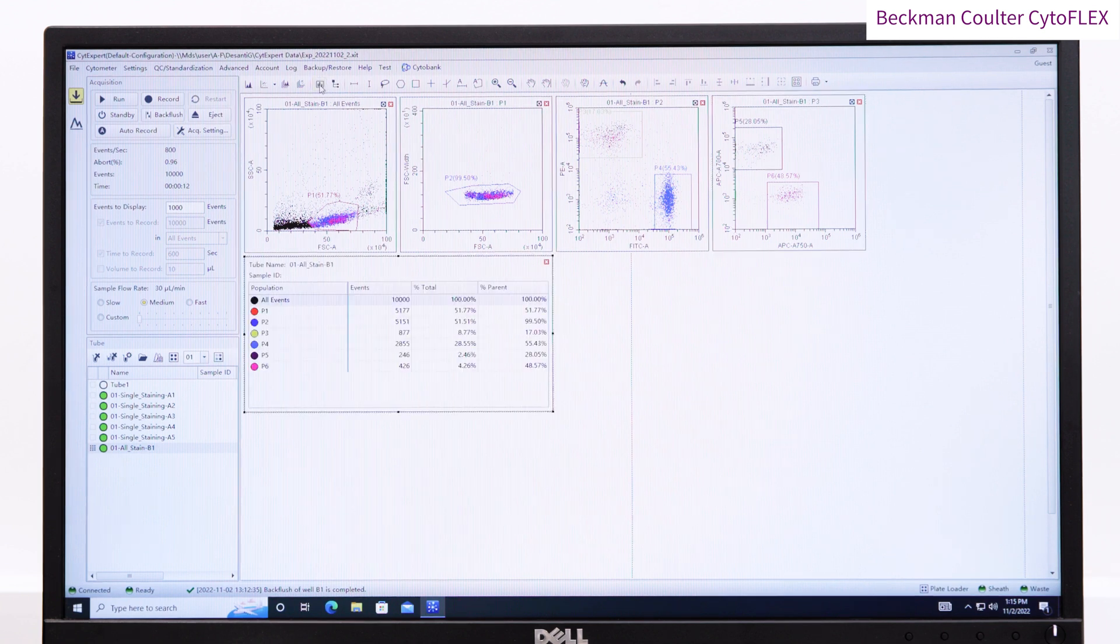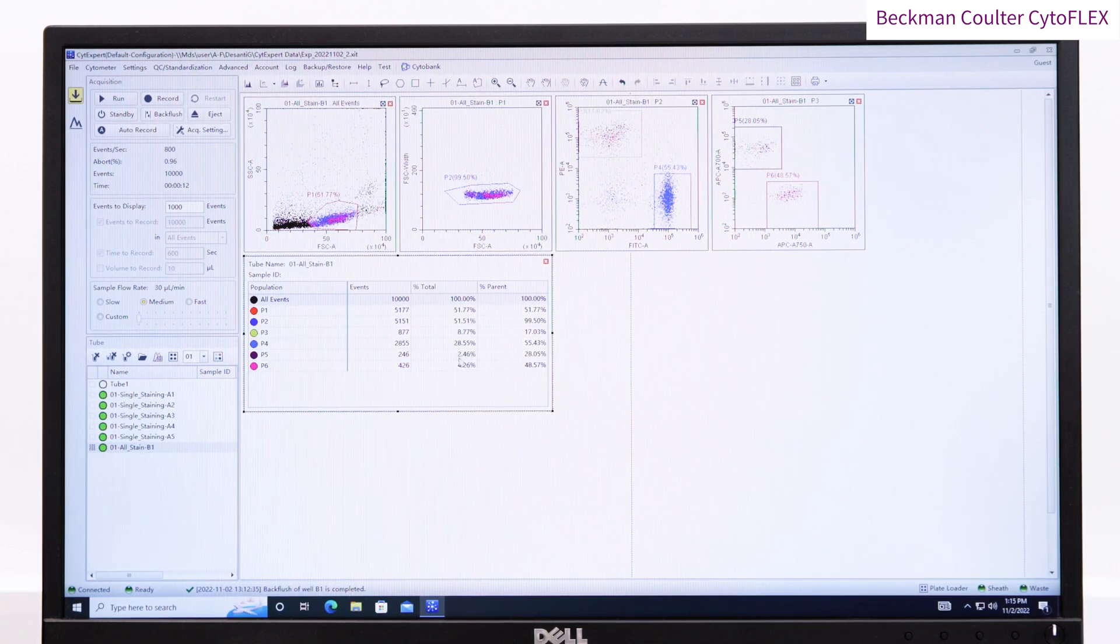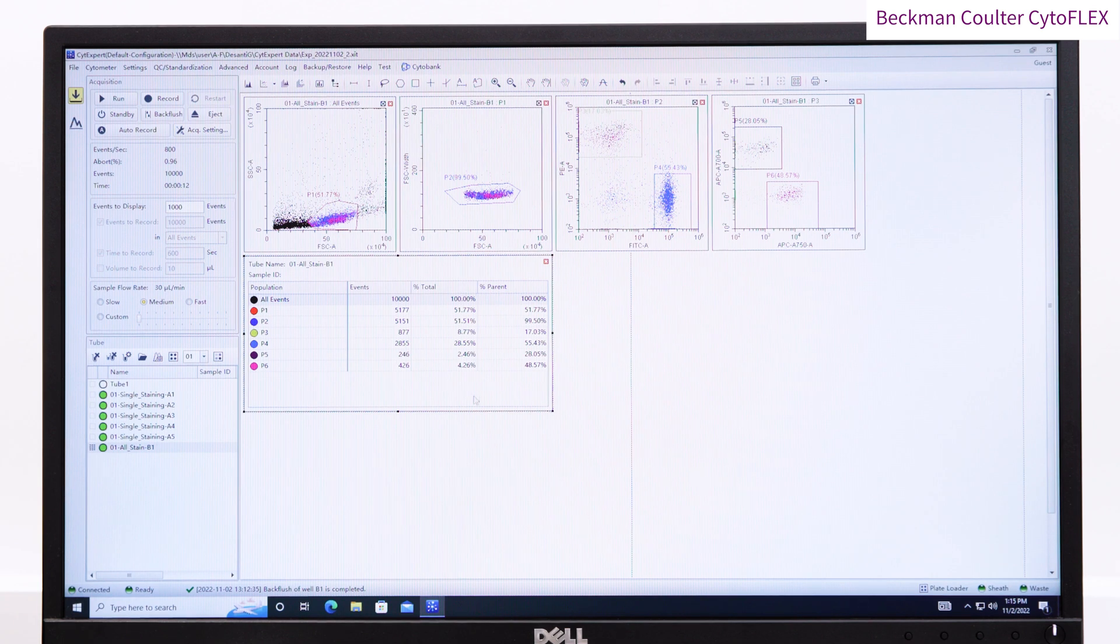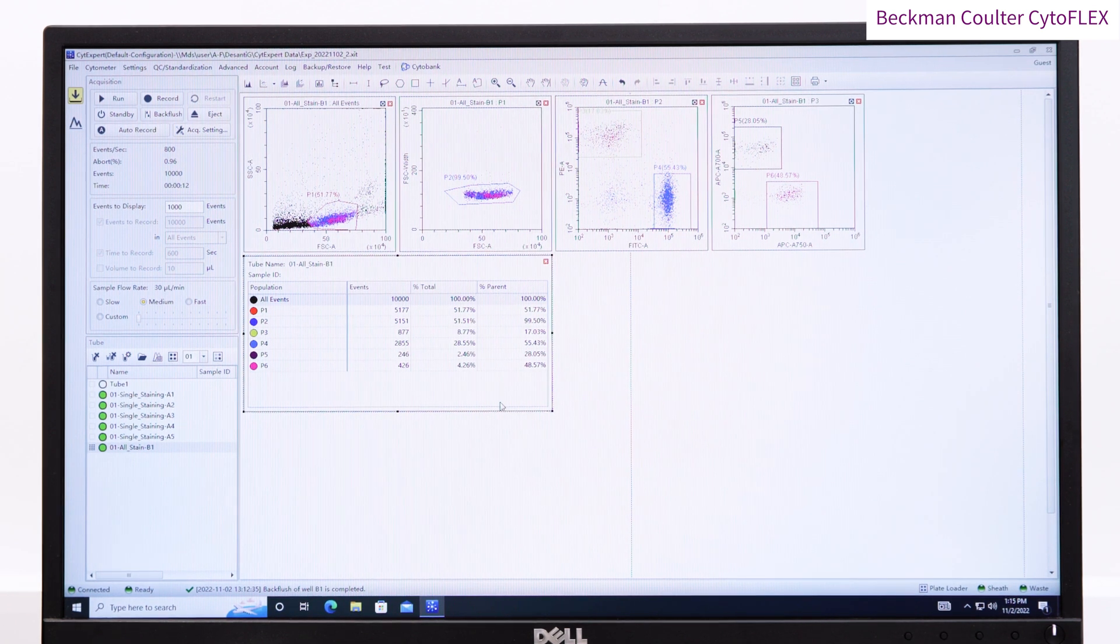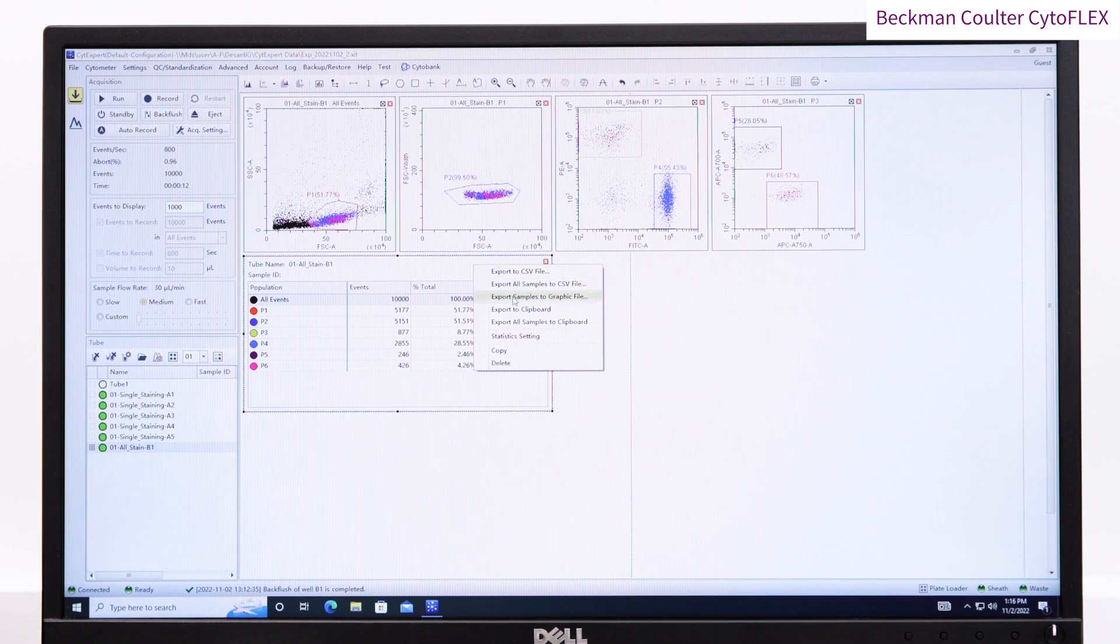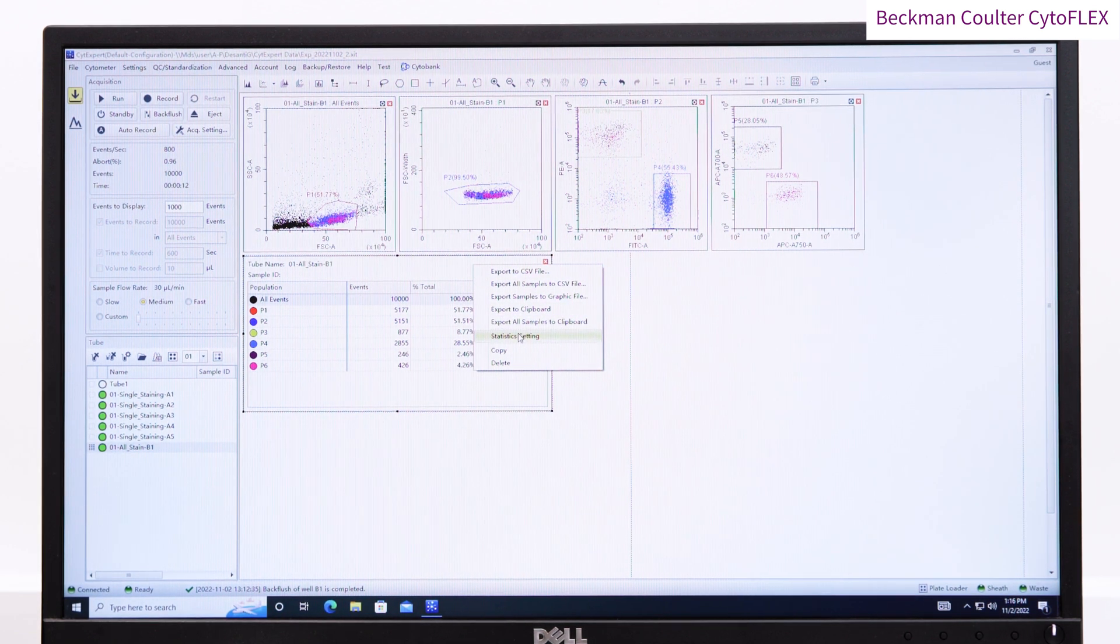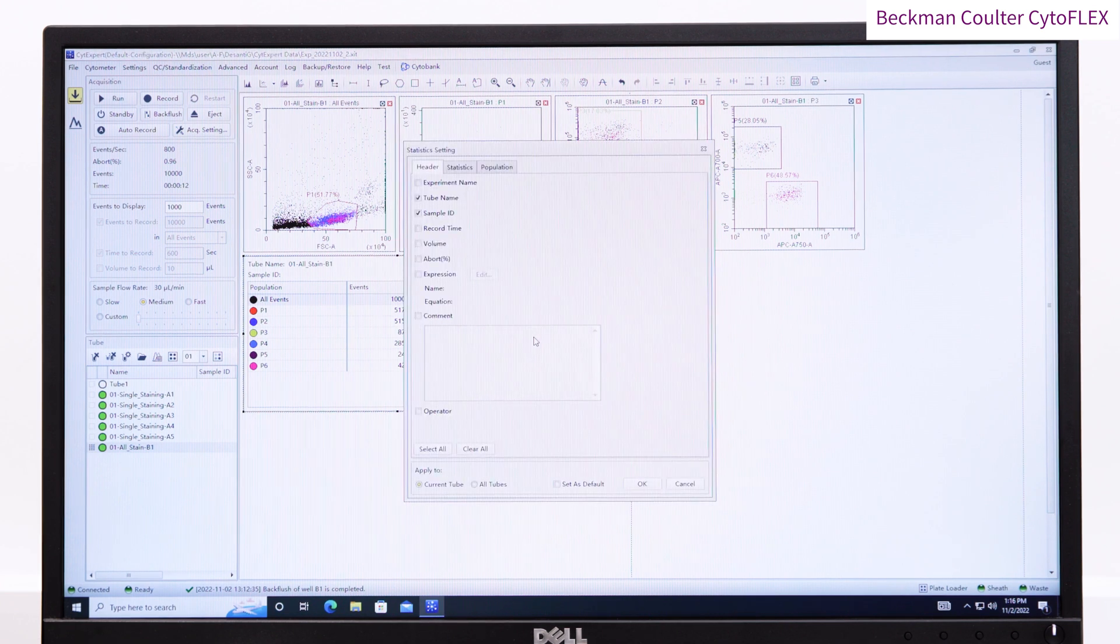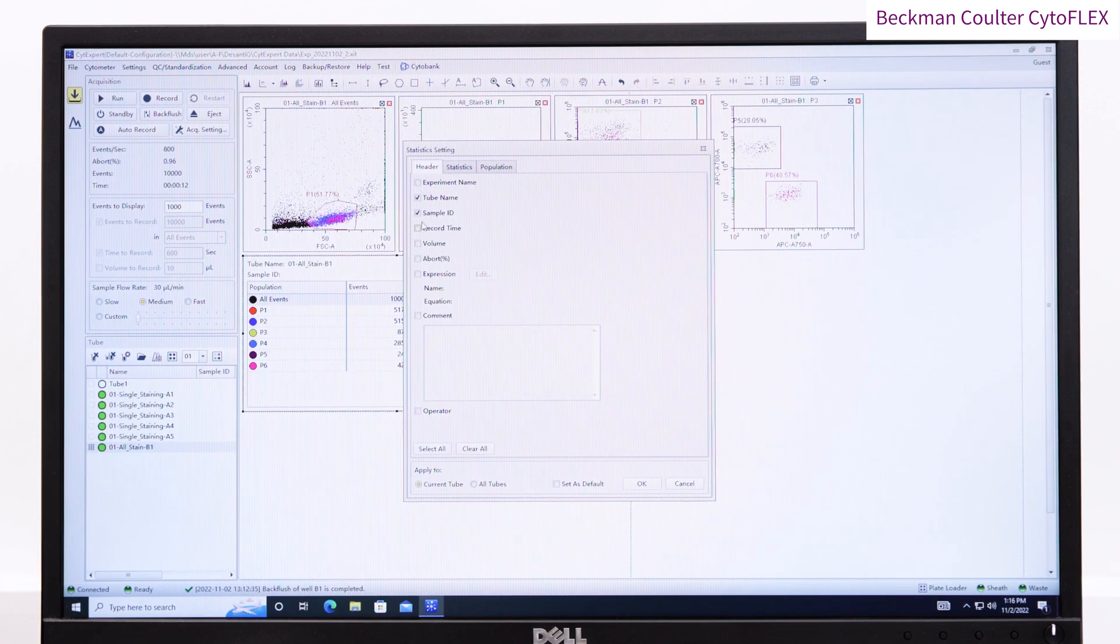Click the Statistics button. Edit the statistics you want by right-clicking on the table and choosing Statistics Settings. You may wish to know the time and the volume ran, and then you can choose the statistics that you want. Almost always you will want the percentage of parent and the median of the parameters acquired. Tick the All Tubes checkbox at the bottom and press OK.